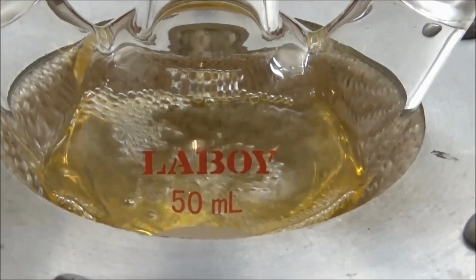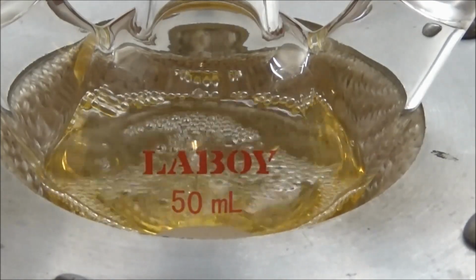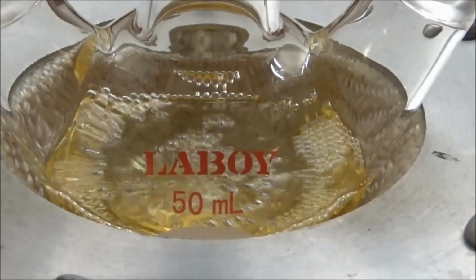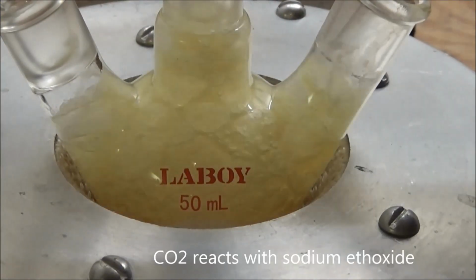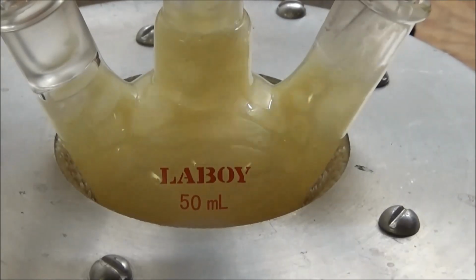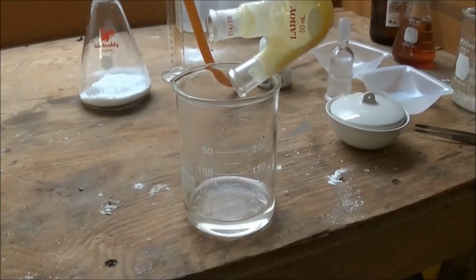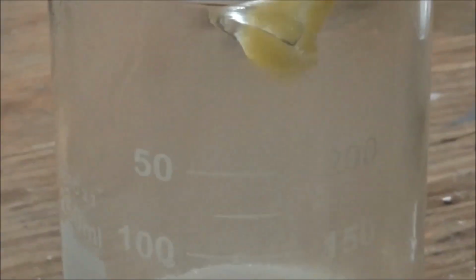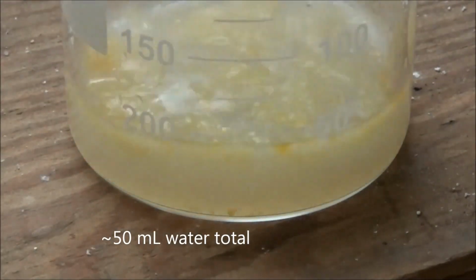I turned off the heating mantle. I started CO2 generation by adding water to the generator and bubbled it through the flask for a few minutes. After that, I very painfully transferred the contents to about 50 milliliters of water.